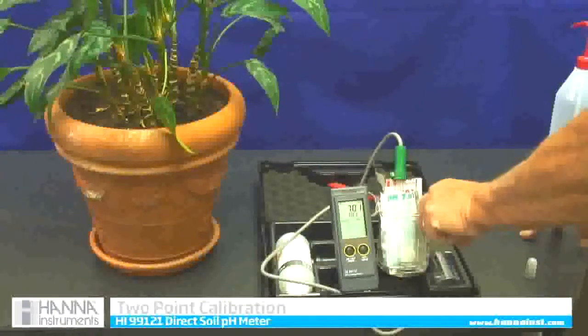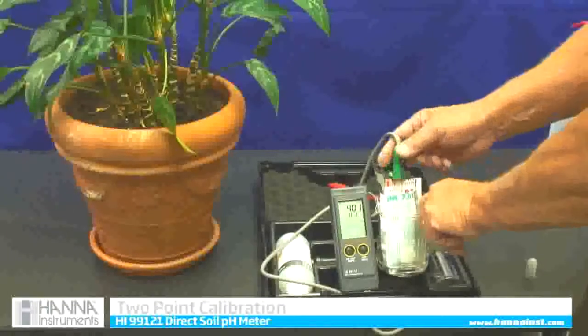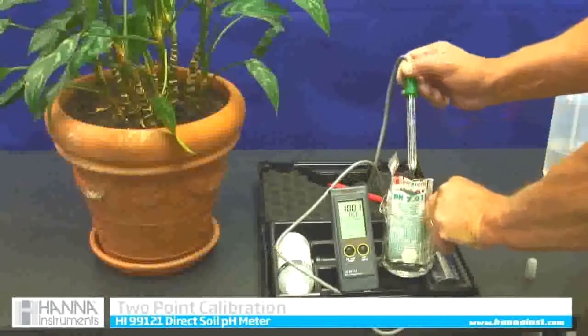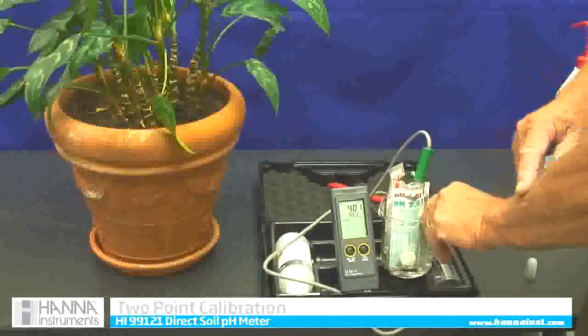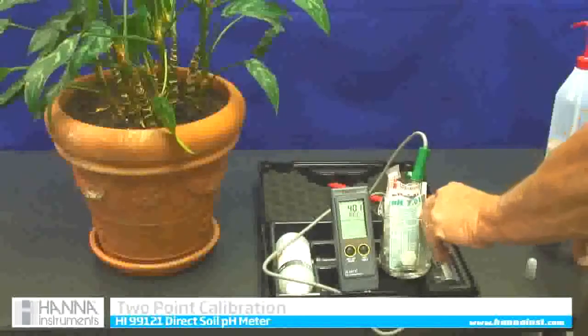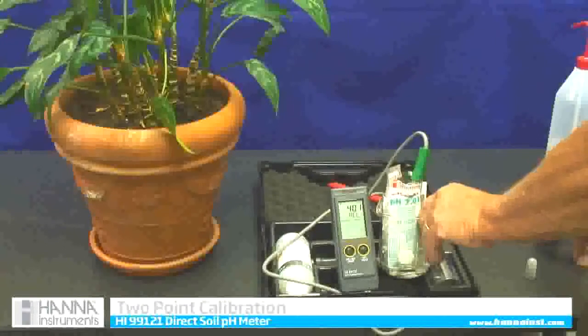It might take 30 seconds or so. While the meter stays in calibration, I am just going to rinse it off with a little bit of tap water. Then it is going to say use 4.01. I put it in 4.01 and it recognizes that. I could also use a 10.01 if I wanted to, but in agriculture we use a 7 and 4 two-point calibration. It makes it very accurate.